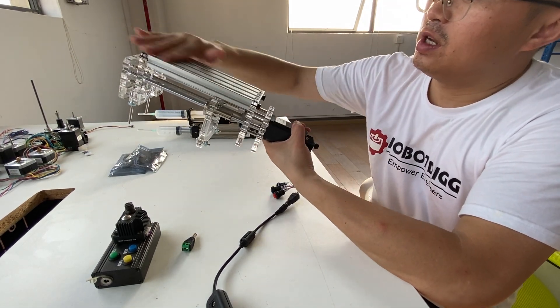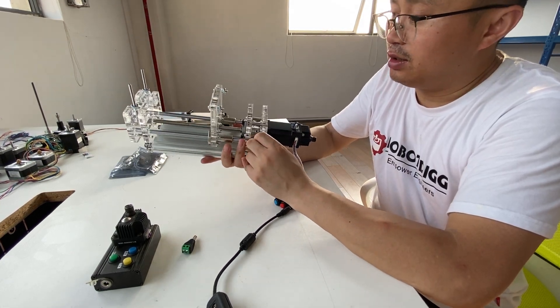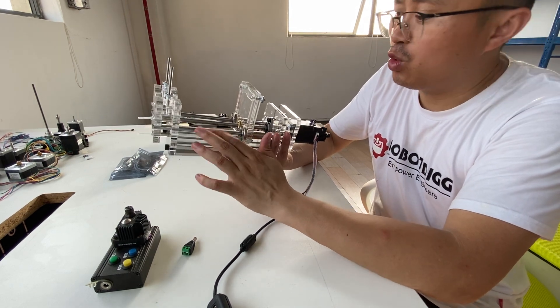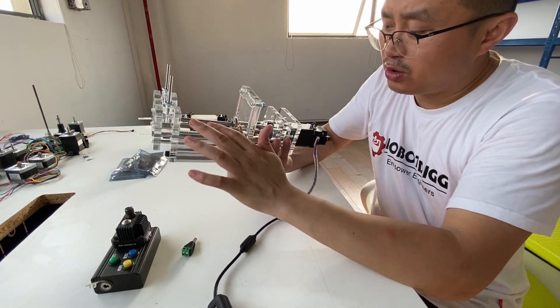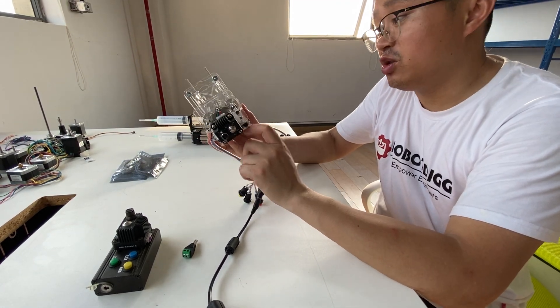This is an aluminum profile, this is an electric plate, smooth screw, lead screw, stepper motor, and this is the stepper controller.